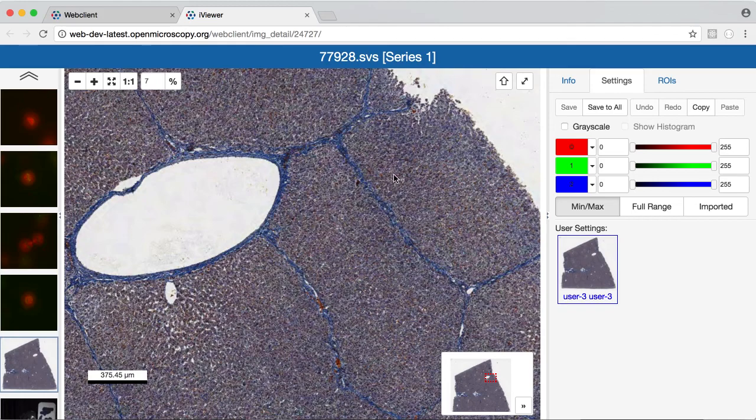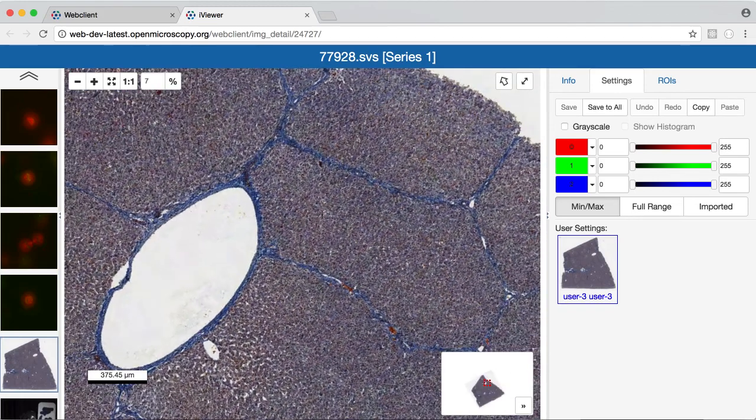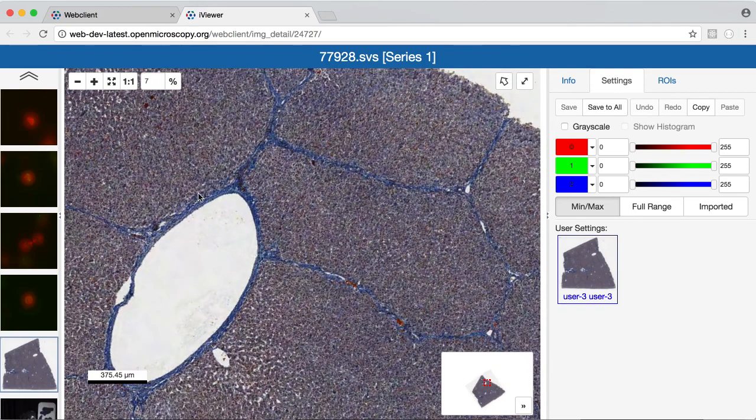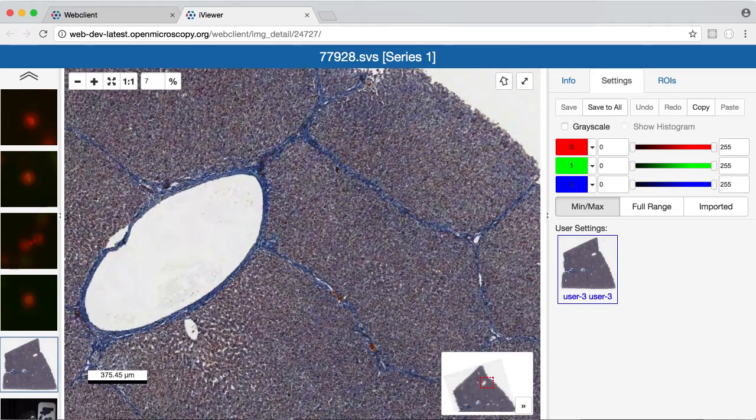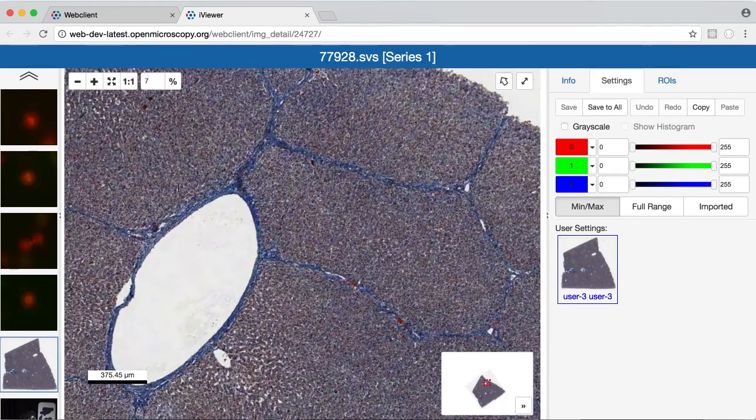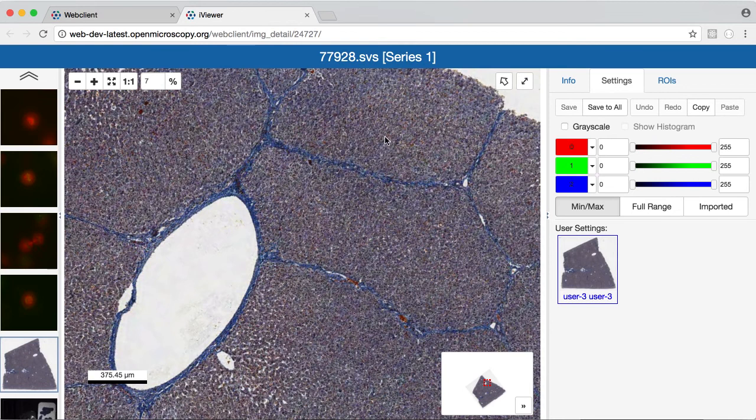By holding down the shift key, I can rotate the image when I drag, and I can reset this by using the reset option at the top.